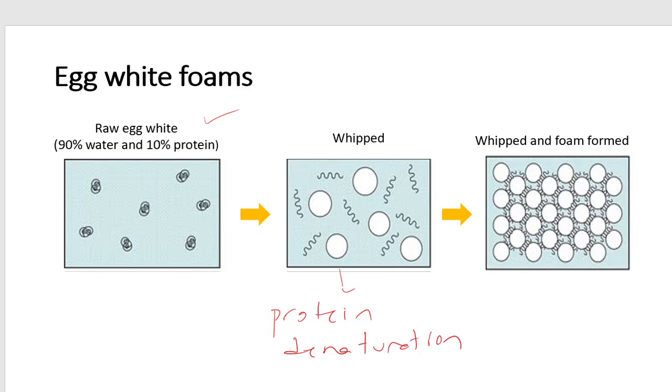Again, the decrease in foam volume is due to the increase in protein stability. That's why in this type of desserts, sugar is usually added after foam formation. So sugar adds protein stability, but decreases the volume of the foams.